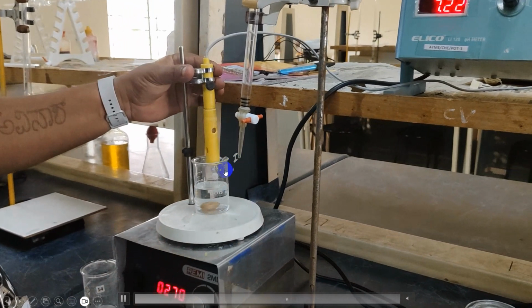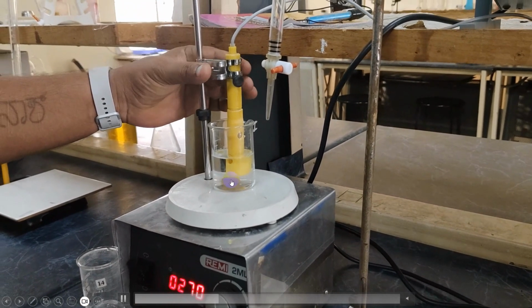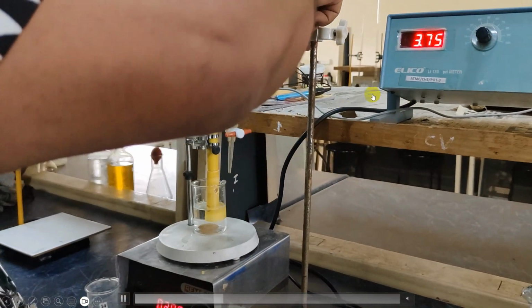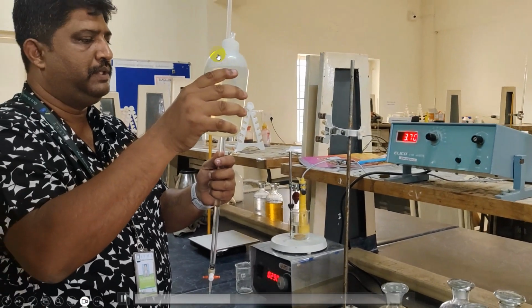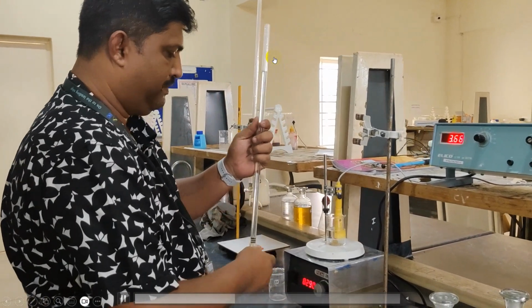So this 50 cm cube is now placed under the stirrer for uniform distribution, and the glass electrode is immersed inside the solution to measure the pH. Now fill the microburette with the standard solution of sodium hydroxide.